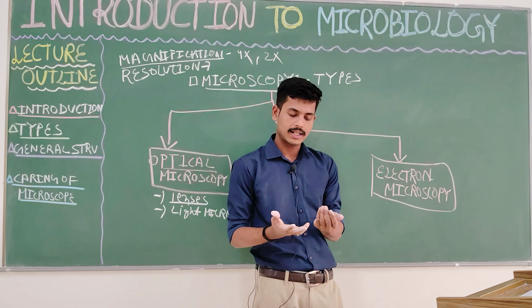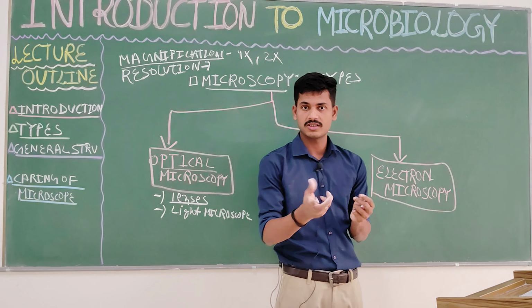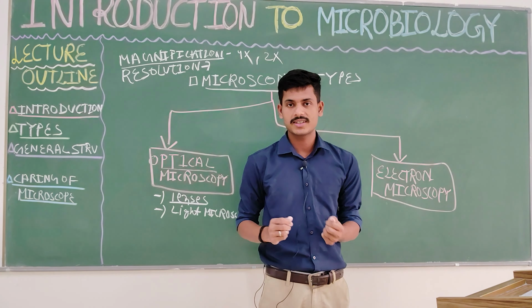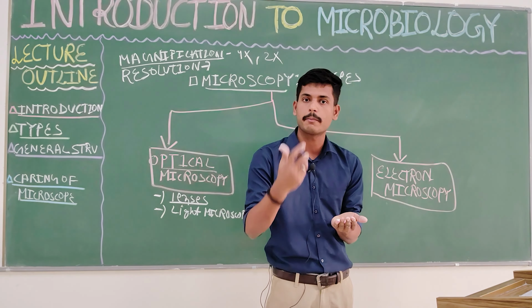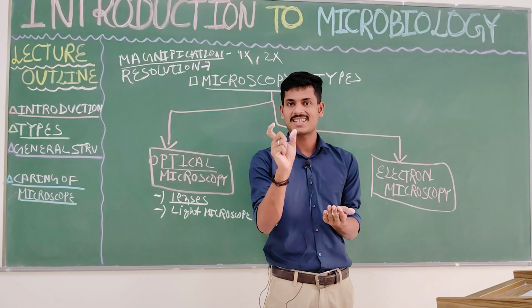Specimens means, suppose the blood is a specimen, or the tissue is a specimen. Specimens means the objects we are going to study on the microscope. They are referred to as specimens.